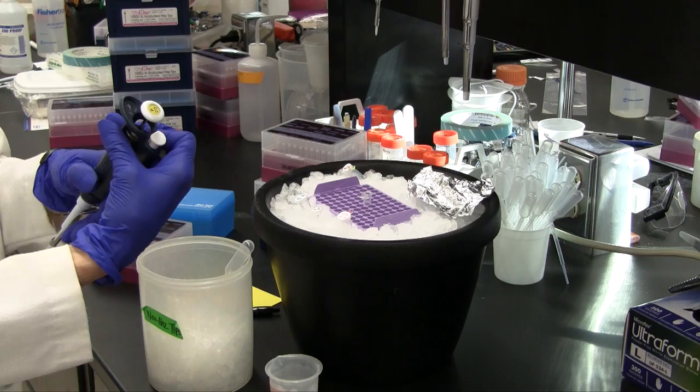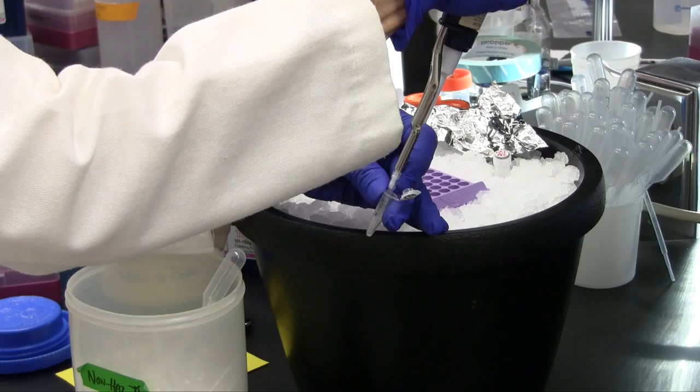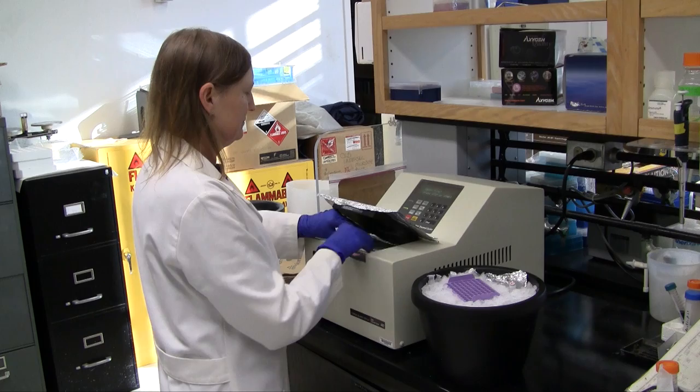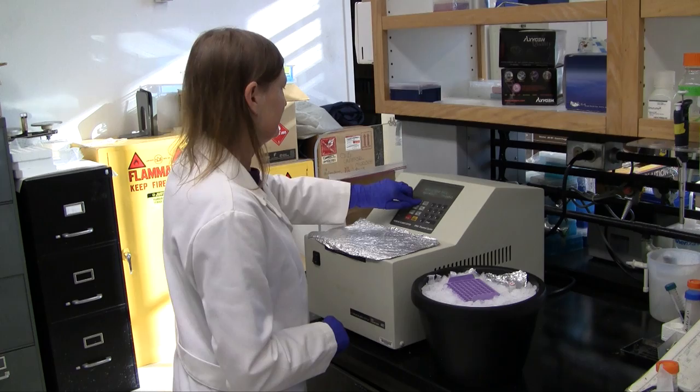Nick translation is used to incorporate a fluorescently labeled dNTP directly into the newly synthesized probe DNA. After calculating the volume of template DNA needed, the necessary components are assembled on ice. The components are mixed by pipetting up and down, as vortexing is too harsh for the enzymes in the reaction. The tube is transferred to a thermocycler set to 15 degrees Celsius for 2 hours. Afterwards, the reaction can be cleaned immediately by column purification or stored in the dark at negative 20 degrees Celsius for later use.